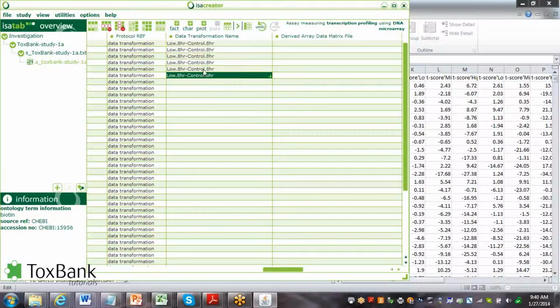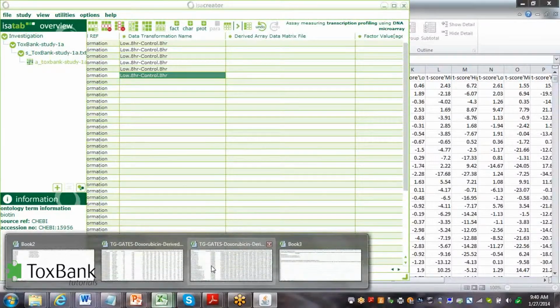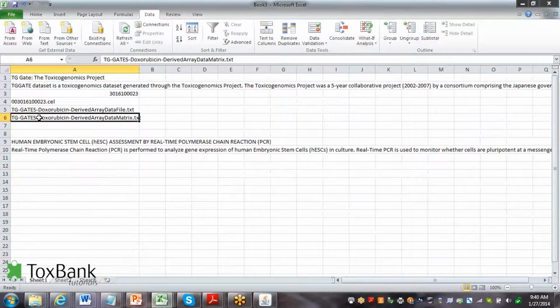You're giving them the name, and then to link that information, again, we don't store any data in the Assay creator or this meta information. But what we do is we will link it then to the underlying file. So I have the underlying file here. Just copy it.